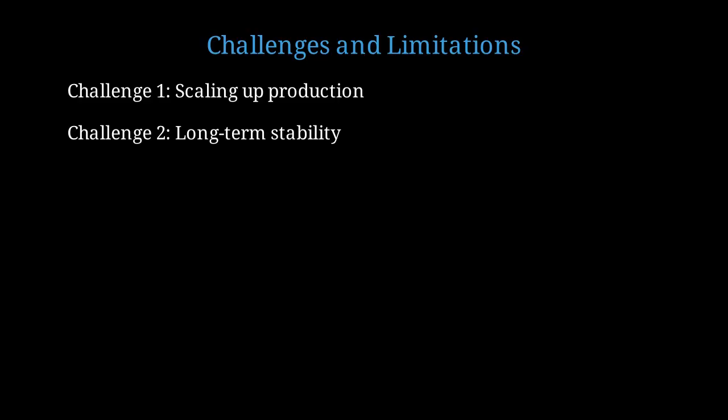Despite the powerful capabilities of microfluidic encapsulation, several challenges and limitations remain. Challenge 1 is scaling up production. Microfluidic devices excel at producing uniform droplets, but throughput is limited. Producing clinically relevant quantities requires parallelization of many devices. Challenge 2 is long-term stability. Maintaining encapsulation integrity over weeks or months, especially for biological applications, remains difficult.